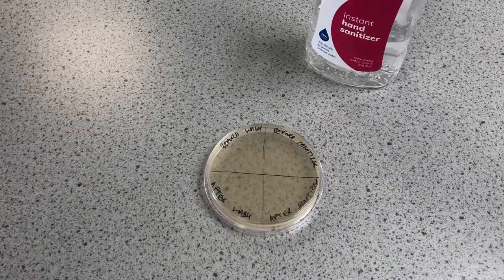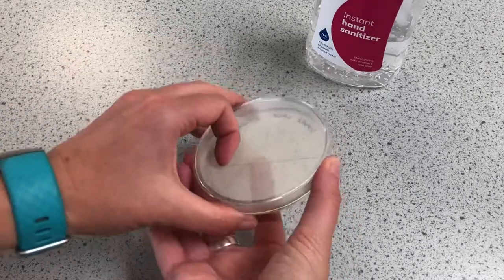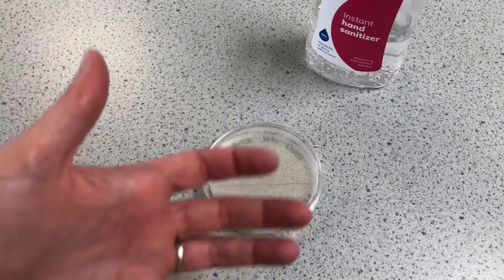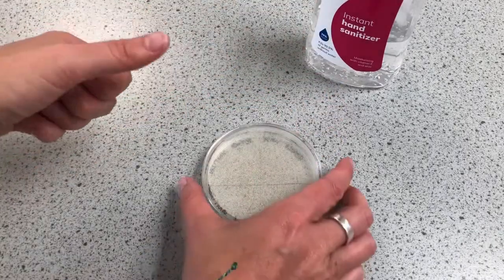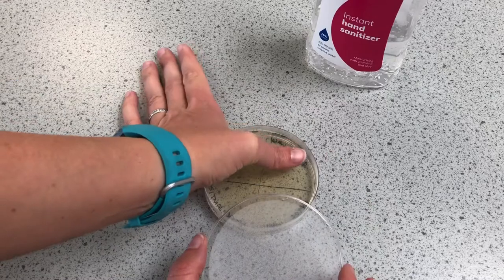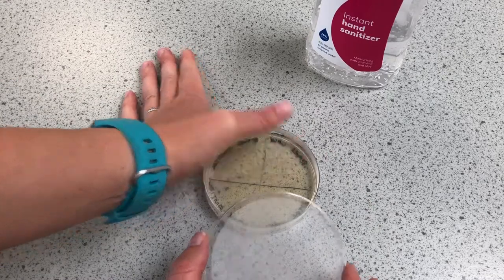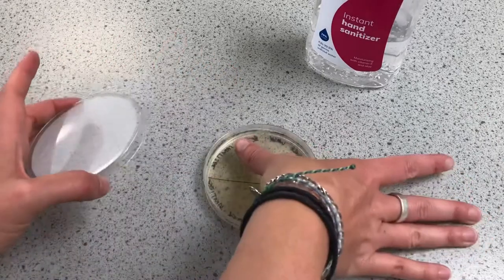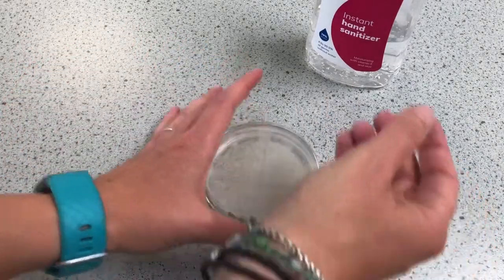So this one is going to be the hand washing, so that needs to go there. This one is going to be sanitizer, which is there. Here is my sanitizer.